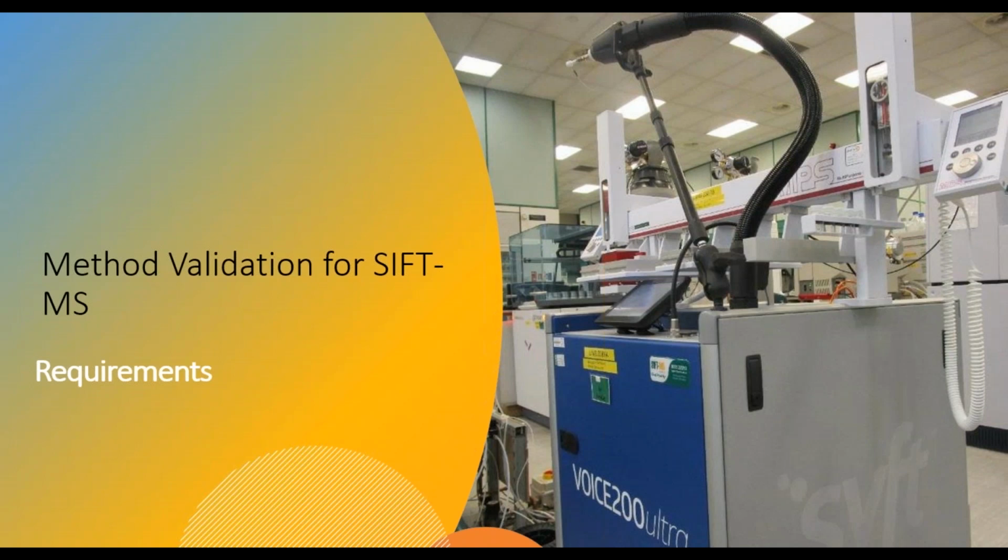So this analysis was basically looking at a drug delivery device that had polymer materials in it, and these polymer materials released formaldehyde into an enclosed packaged space. So these are pouched devices, and they were interested in looking at the formaldehyde concentration in the packaging within the pouch itself. And so we needed a method that would, A, find formaldehyde, and B, then validate that method to the requirements of a regulatory submission.